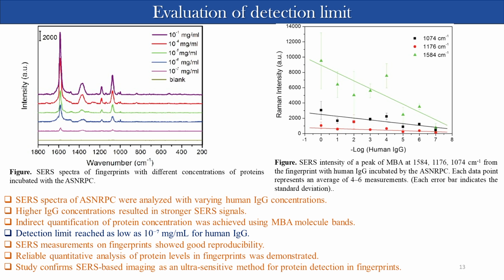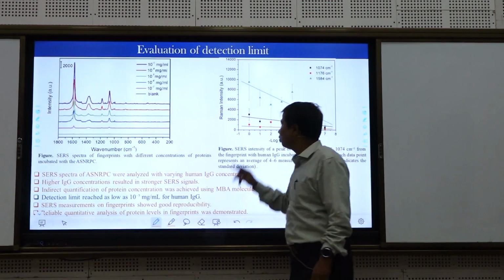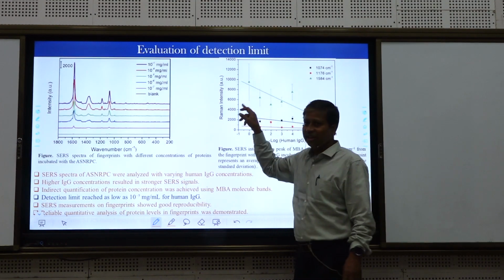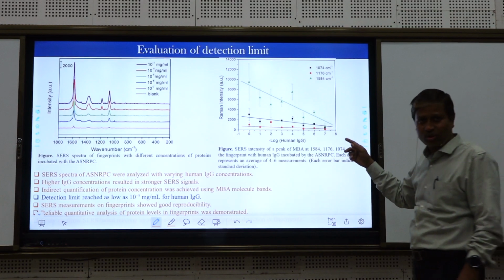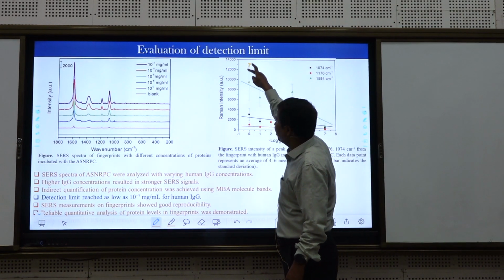Yes, these are the error bars. Error bars are very much necessary if you want to make your data convincing. If the error bar is large like this, then that data point needs to be repeated. The data point does not have much confidence, so one will not place much confidence on this data point.